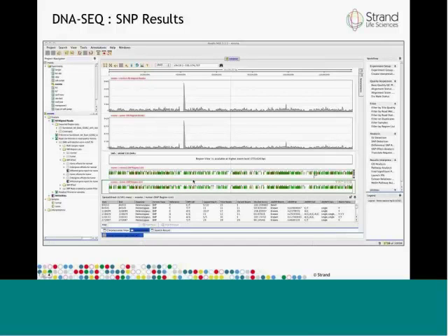The defaults in these tracks are also set up nicely. So the labels that are shown at some of the places are the SNP calls themselves. The colors that are shown for the SNP calls are based on the decibel score for the SNP call. Green indicates a low decibel score, and red indicates a high decibel score. Now there are several ways in which you may want to go forward from here. Note that at this stage we are looking at chromosome 10 and the entire chromosome.